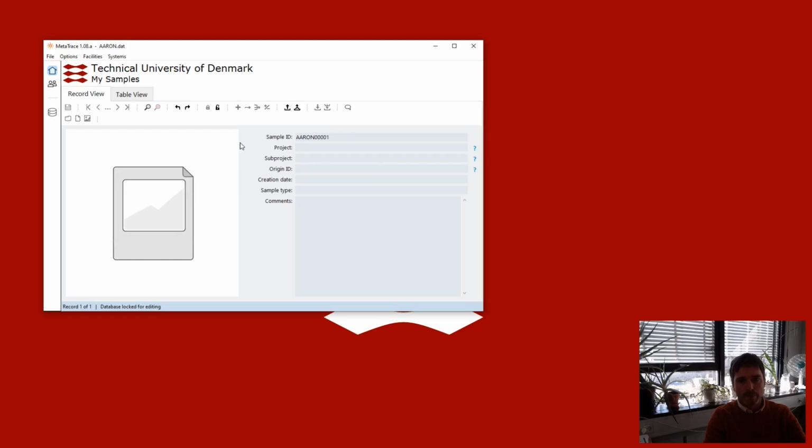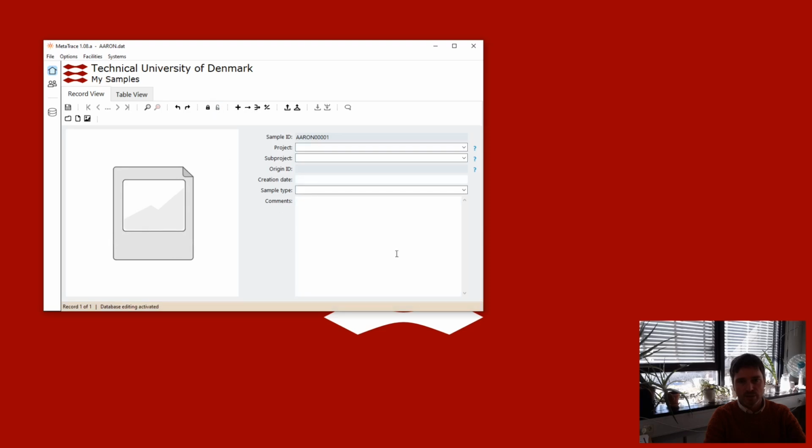So at the moment we have one record in our database, and if we unlock our database, we're now able to edit these different fields. So for now we'll just click on our project, and we'll see we also have sub-projects for here as well. So we can just select one of those. We can include a sample date, so we can just say today's date. And now we can also select our sample type.